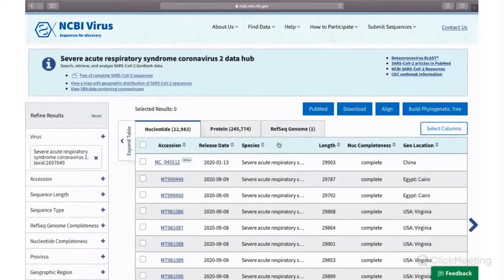First, let's look at the tab right on top. There is an accession number. As we hover through these tabs, we will be able to see what it is specific for. So the accession number is the unique sequence ID or this unique sequence accession number, which we can note down and use for publications, and we could also use it in order to search for a particular sequence.